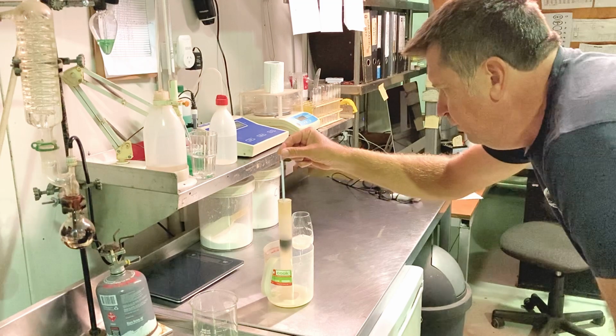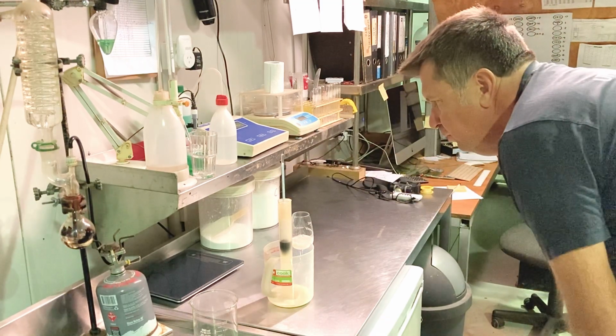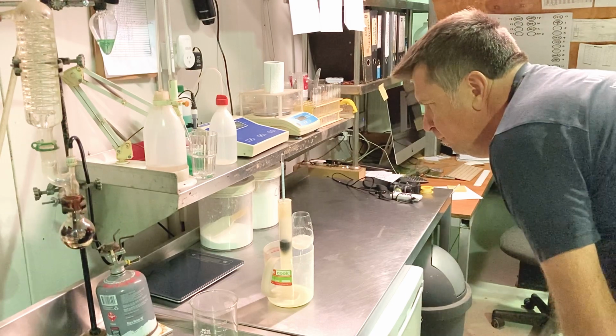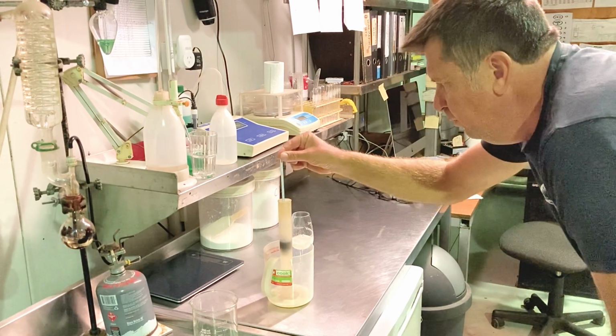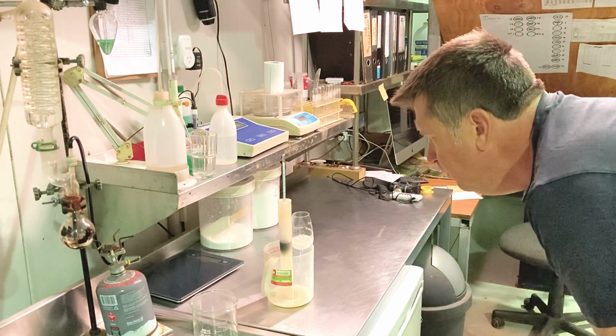And we're monitoring that reaction by looking at the sugar level and the alcohol. So as the sugar level goes down, the alcohol level will go up, because the reaction is the yeast plus the natural sugars in the grapes turn into alcohol and carbon dioxide.